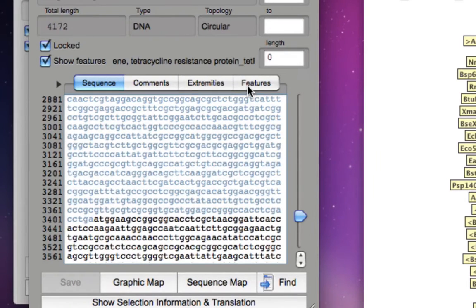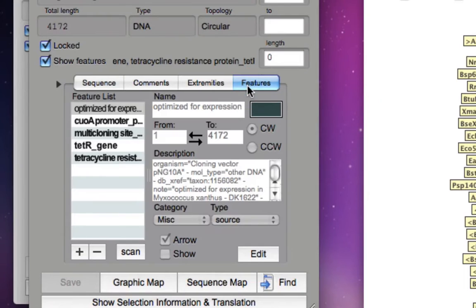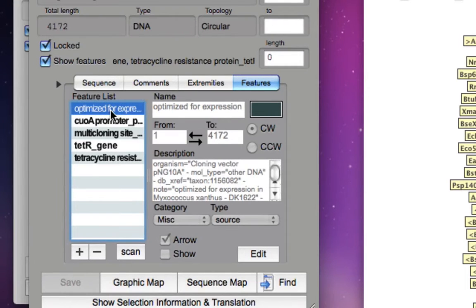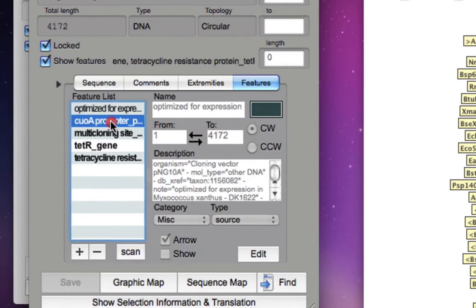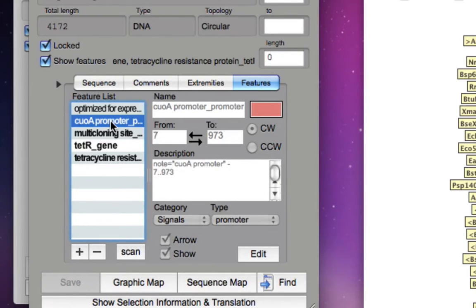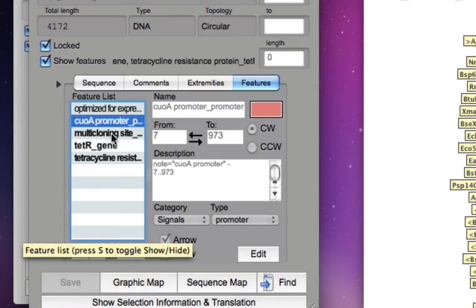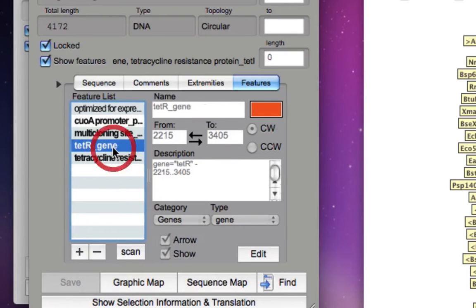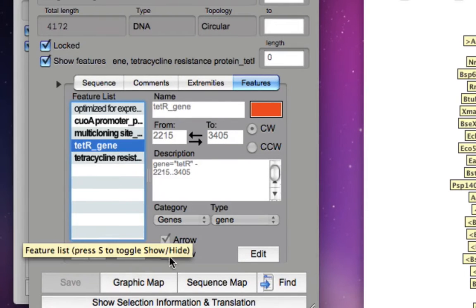These are the features: it is optimized for expression, it has a QOA promoter, multiple cloning site, tetracycline resistance gene, etc.